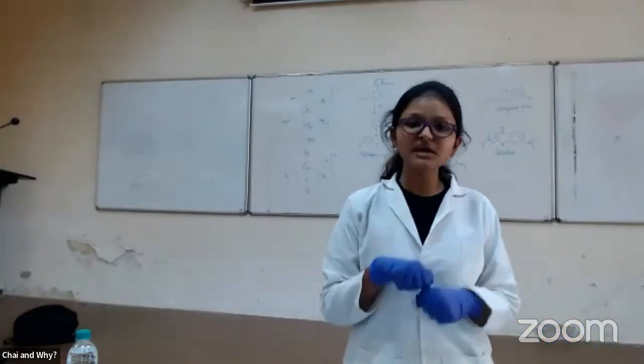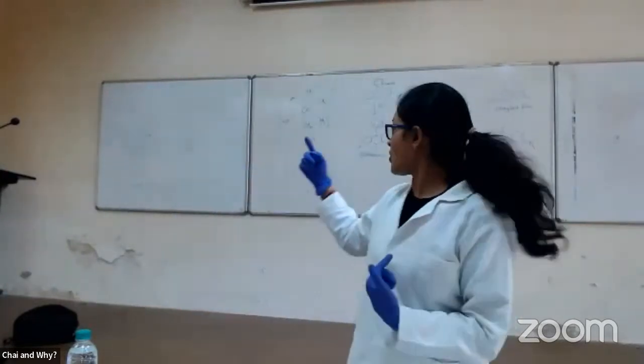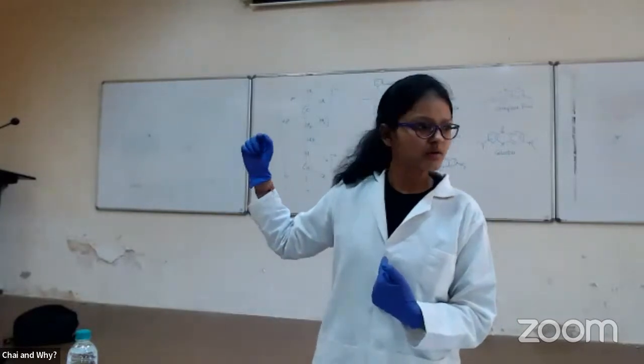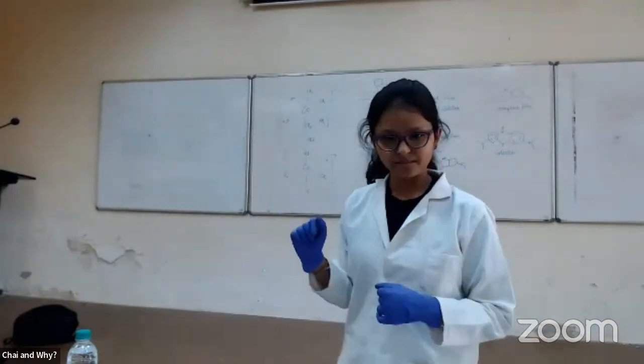Now when I added HCl to it, what happened? These neighboring ligands changed from sulfate to chloride. So you can see the structures on the board. Like, can we zoom in there? I think it is visible from this camera. This camera, I think this is pretty clear. If you move out, I can try on this camera also.